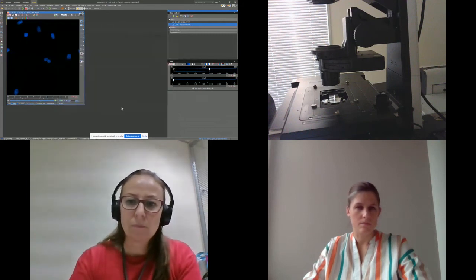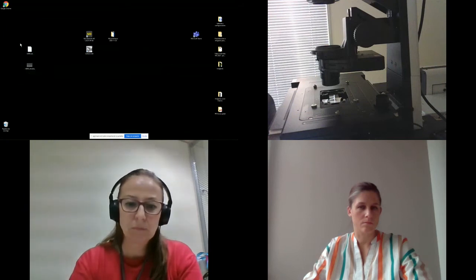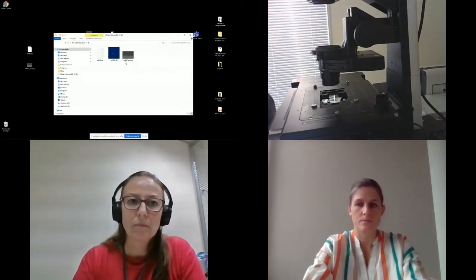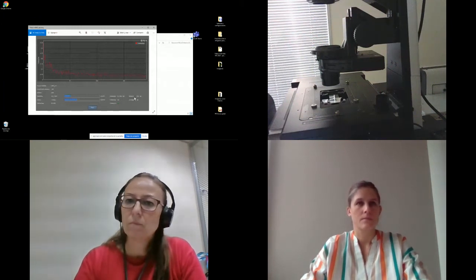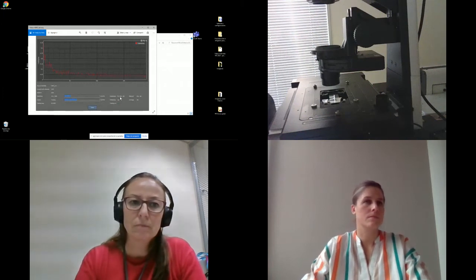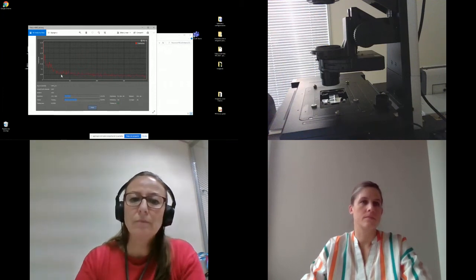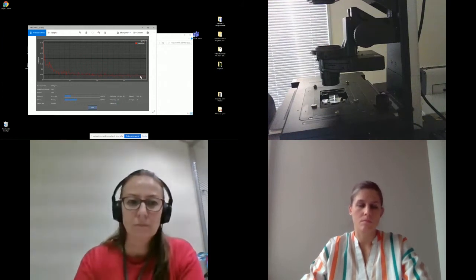I'm going to move to the desktop, and you can see that on the desktop I have two images. The first image is our neural network, the one I've just created, which is not correct, of course, and the training loss I got when I finished my training. But what I did this morning is this one, and here we have the file I'm going to use, and this is the training loss I got this morning. As you can see, there is an exponential curve. I decided to stop it, although I should have done it perfectly. If I had done it perfectly, it would have taken almost 4 hours more. I decided to finish after 53 minutes, as you can see here. But you can see that the training loss is below 5%, so I expect that the images we can reconstruct from the low signal to noise ratio images are fine.